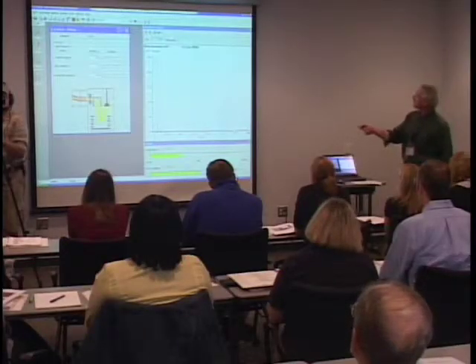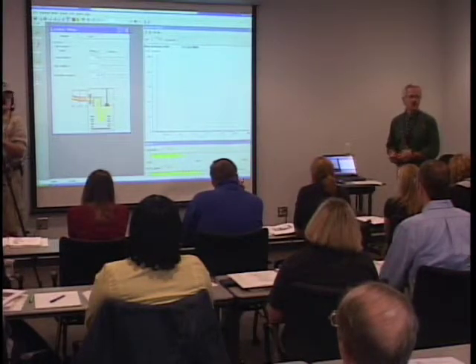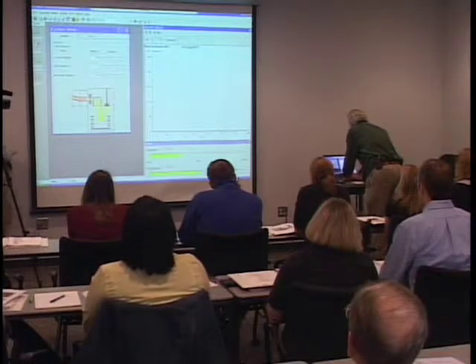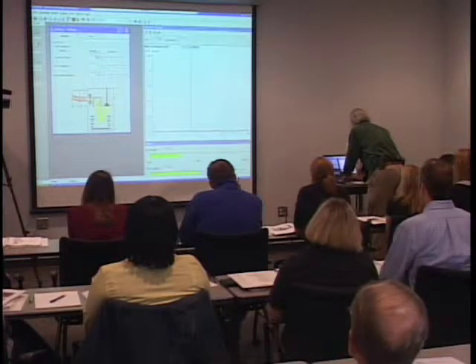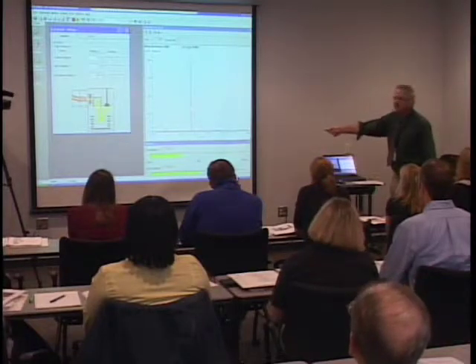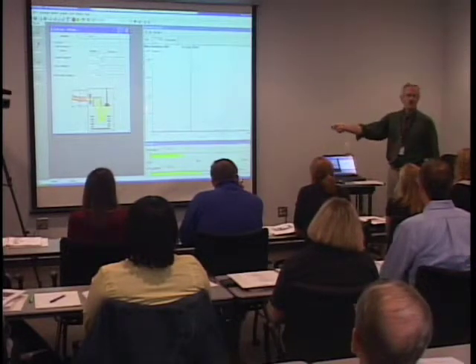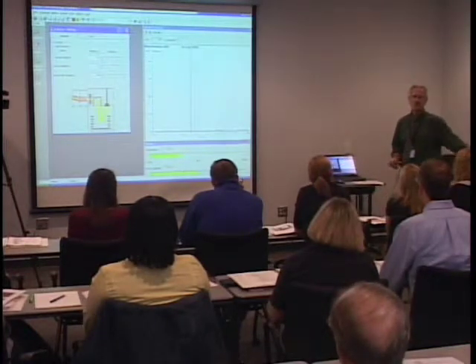The peaks voltage divided by 10 gives you the lowest mass — around here it's probably around mass 60. If we lower this to 100, we will see low masses. The mass 37 peak is the water dimer: water is mass 18, so 2×18+1 = 37. That's our low mass background. You can see a little bit of 18 and 19 — some ammonium, some water, and mostly water dimer here. That water dimer is not very stable, so if we increase the orifice voltage, it's going to break apart to H3O+.